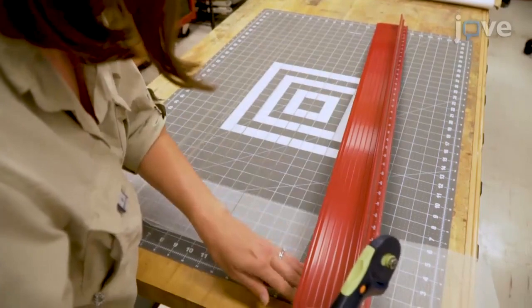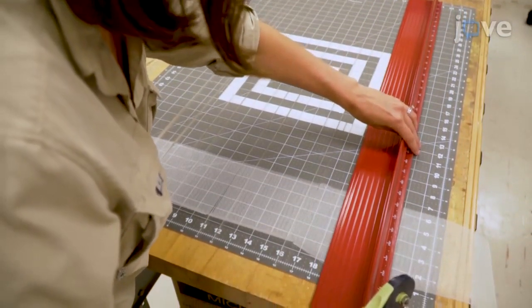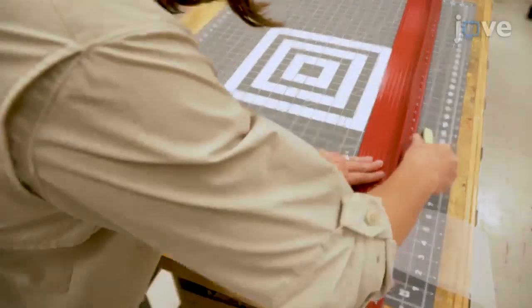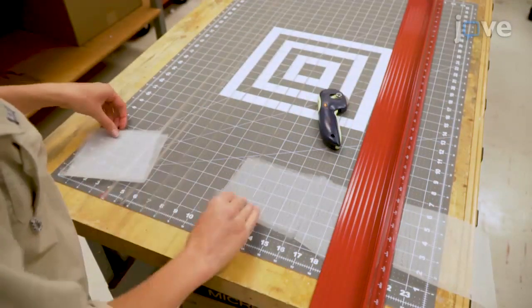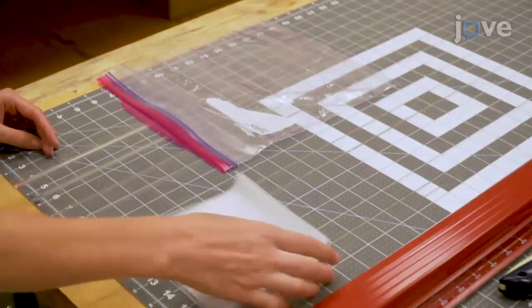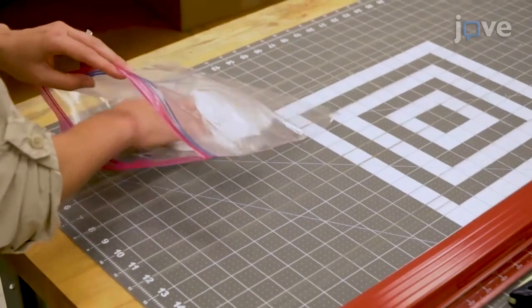To construct the adult sentinel cages, first use a rolling disc cutter, straight edge, and cutting board to prepare two 5x5-inch tulle mesh squares per sentinel cage from bulk tulle yardage. Store the tulle mesh squares in batches of 50 in 1-quart resealable plastic bags.